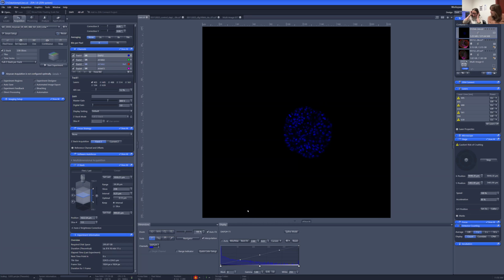Awesome. Okay. So I'm going to get started driving the scope a little bit, and as I'm working, I'm going to turn over a lot of the talking to Jess because I can't really multitask very well.